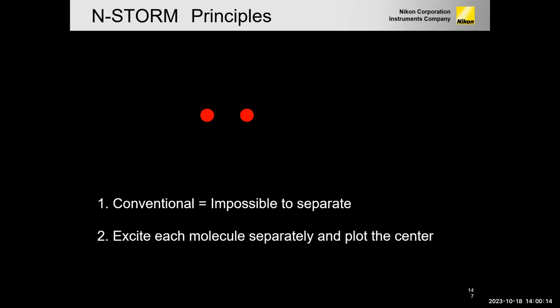Now, many times these two dots will blink together, but many times they will not blink together. So we call that non-specific activation. The software will reject that automatically. So two dots next to each other blinking at the same time, it will not record that. Correct. We call it NSA, non-specific activation.